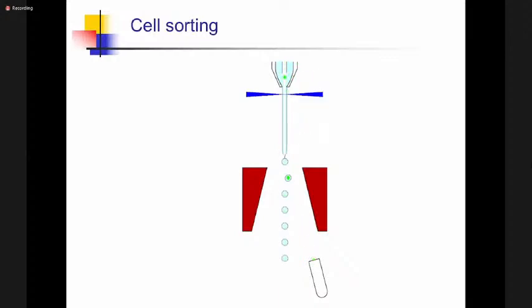I gave you the example of the pathogenesis of the Kaposi-associated herpesvirus or Epstein-Barr virus, which goes into latency. But then at the lytic stage, they can transform that cell into the lytic phase. Lytic phase means that the cell now divides and proliferates, becoming much more tumorous. So in this case, you are interested in only collecting those cells which have turned lytic and leaving alone those which have not turned lytic and still remain in latency. Hence, you are sorting these cells according to the population you are interested in. Once you collect this tube of cells, you can go back to the laboratory, culture them, expand them and do the experiments which you need with them.